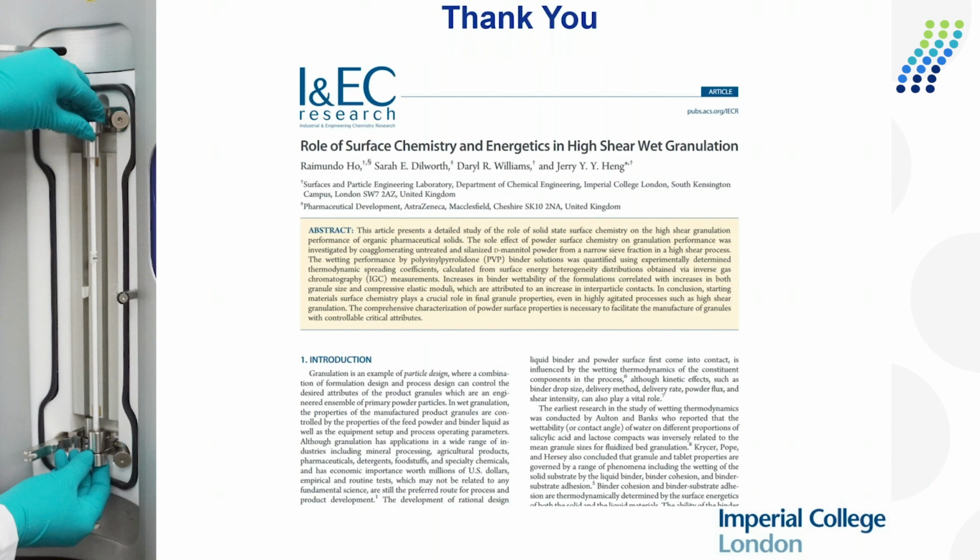When measuring 3 components, diiodomethane had very similar retention times, and methane is a major problem. Can you comment on that? In our IGC experiments, we use alkane molecules to probe the dispersive components of the surface energy. In the wettability experiments, we use diiodomethane to probe that. We don't use diiodomethane in our IGC experiments. So that's probably either I haven't understood the question, or if you have another question, come back to me on that.